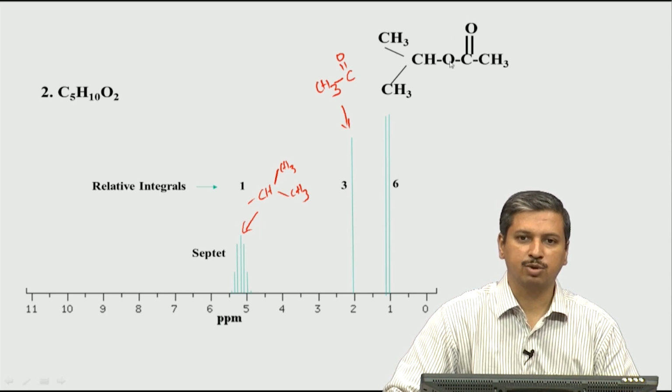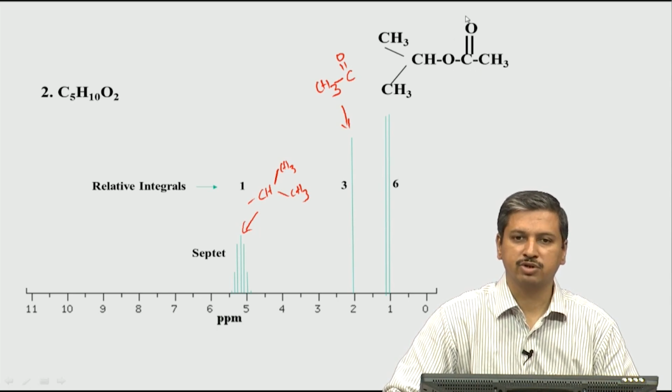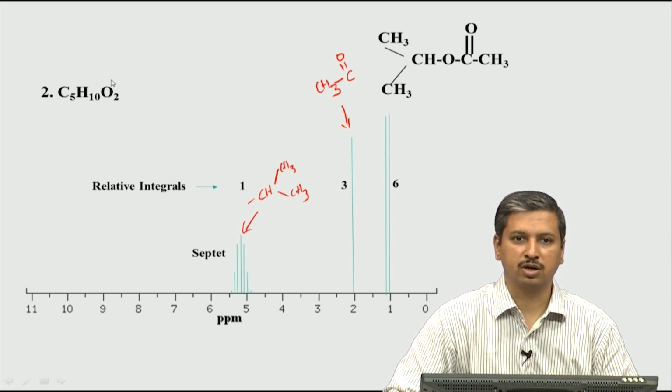When we include the carbon spectrum later on, you will see that it becomes easier to interpret, because the carbonyl frequency in NMR for an ester group is much different from what you get from a ketone group or what you expect from an aldehyde. So, based on the carbonyl peak, you can also figure out whether an ester group is present, or whether it is a carboxylate group and so on.